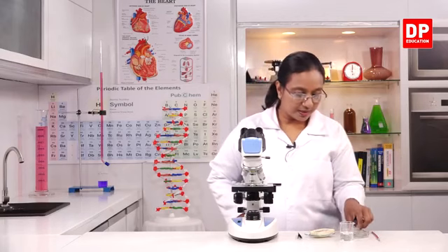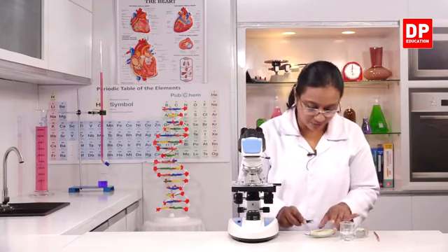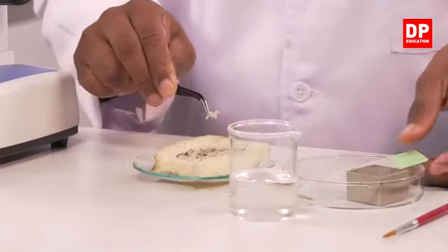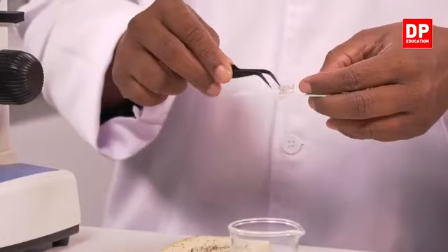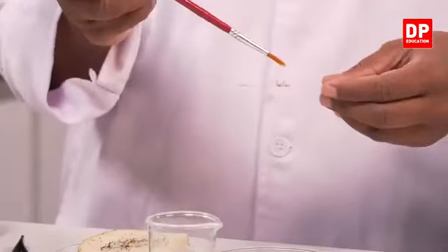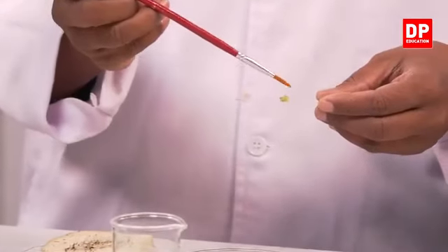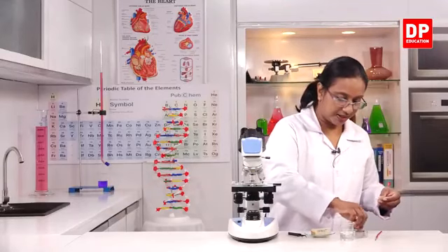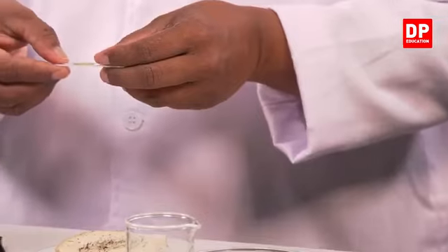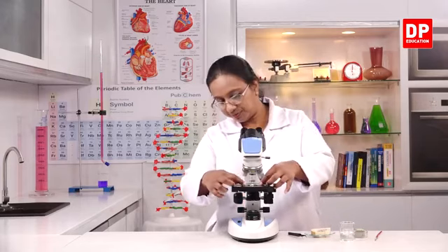So from this we have to take a clean glass slide I have here, and take a small sample of the fungus, the piece of bread with the fungal growth, and place it on the glass slide, and then I will put a drop of water on it so that you can easily cover it with a cover slip. And here again I have a clean cover slip also. So we place that, and now we use it to observe under the light microscope.